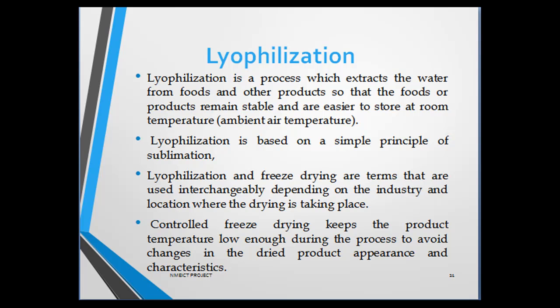Lyophilization and freeze drying are terms that are used interchangeably depending on the industry and location where the drying is taking place. Controlled freeze drying keeps the product temperature low enough during the process to avoid change in the dried product's appearance and characteristics. It is an excellent method for preserving a wide variety of heat-sensitive materials such as proteins, microbes, pharmaceuticals, tissues, and plasma.